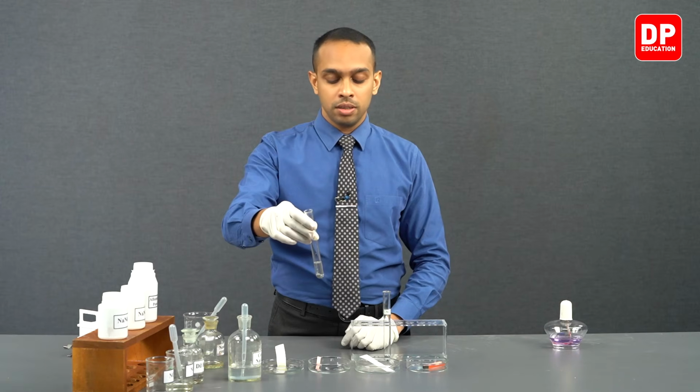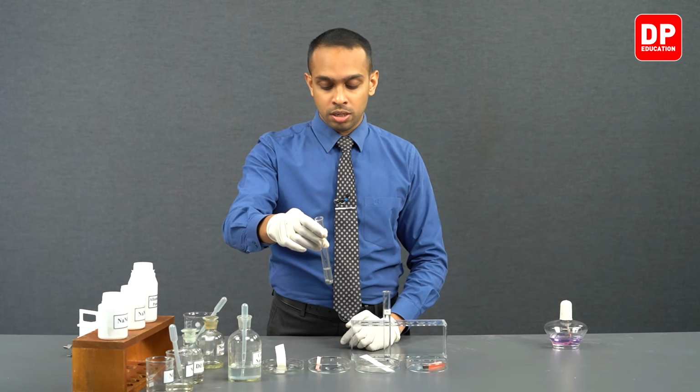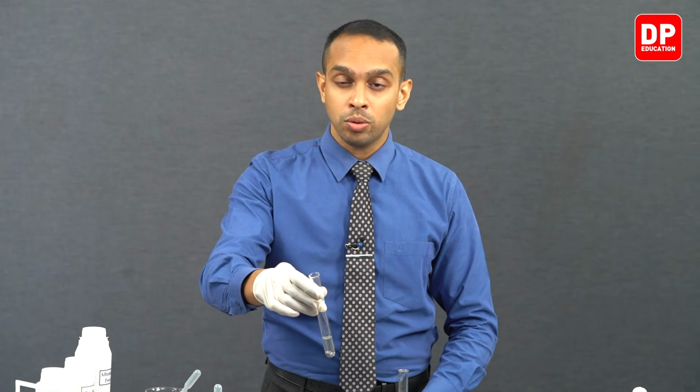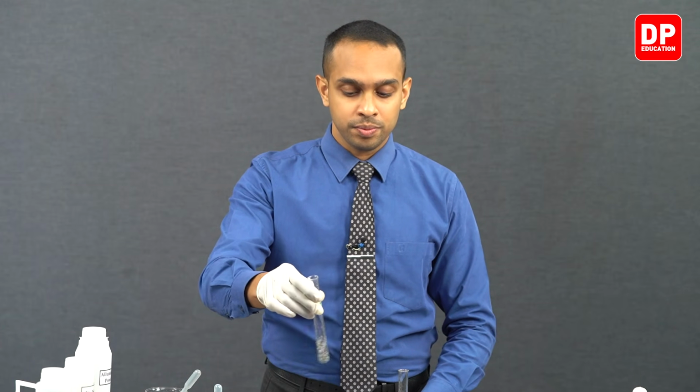So at that point, we will bring the filter paper that is soaked in Nessler's reagent over the mouth of our test tube and observe how the filter paper is changing its color.